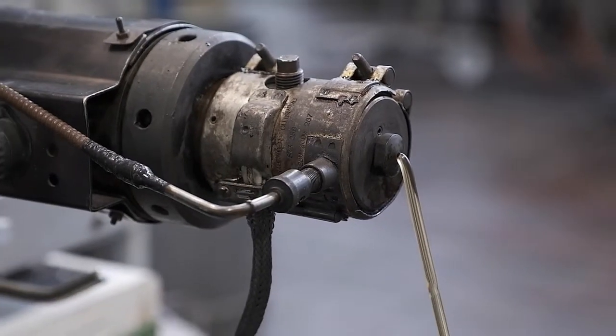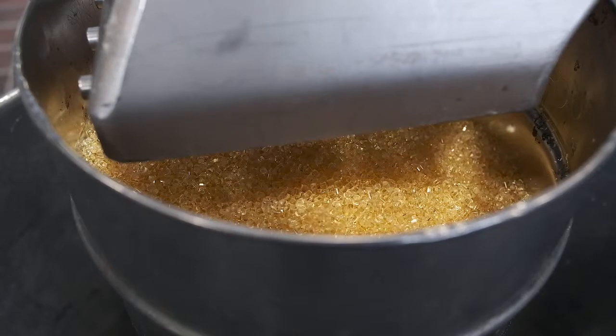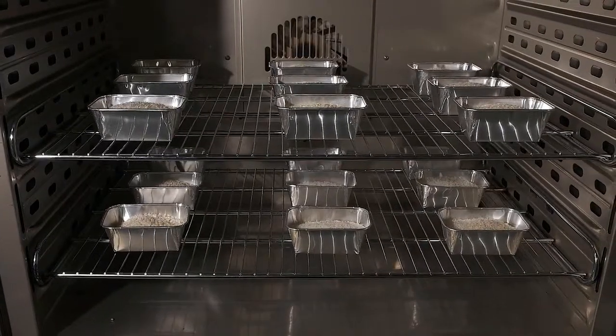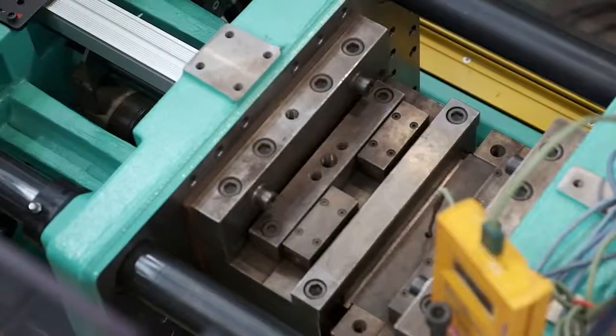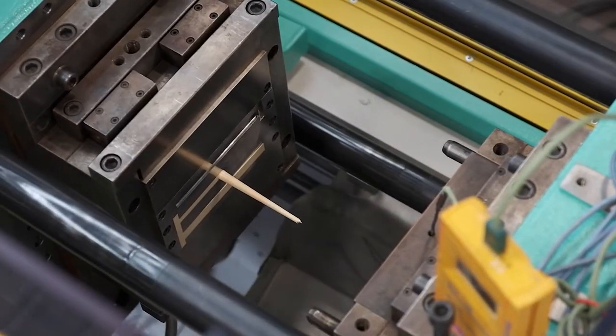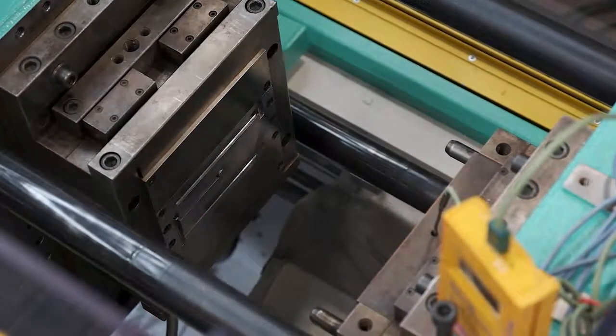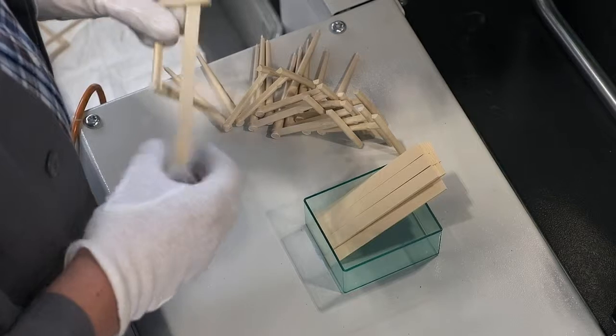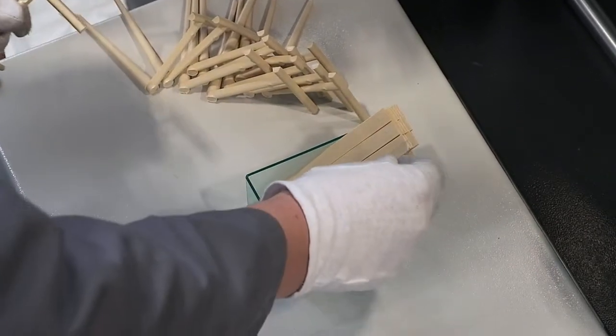Therefore, we performed artificial aging by doing multiple extrusion steps and oven aging. In order to get reproducible analytical results, the artificially aged granules are injection molded into standardized specimens.